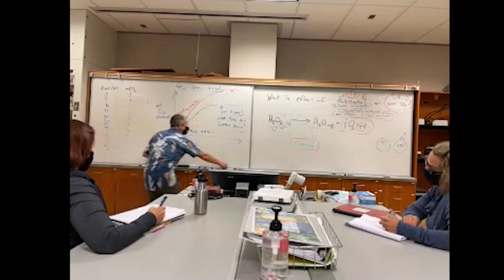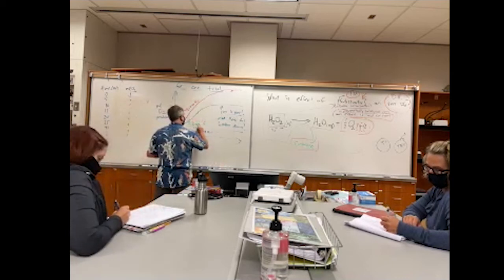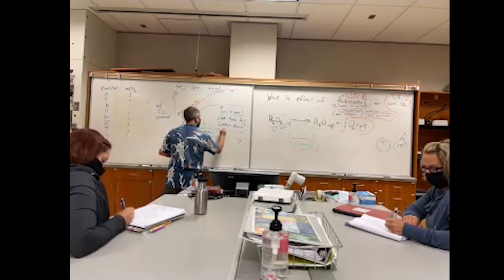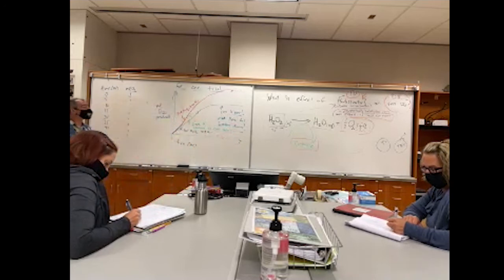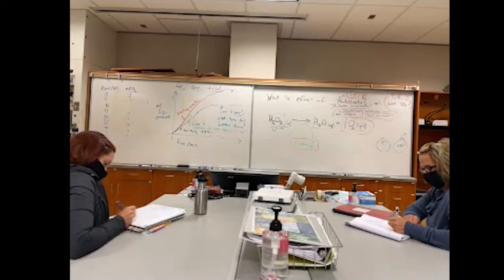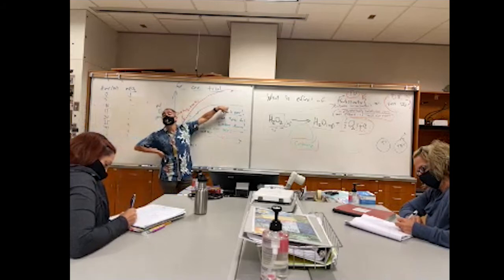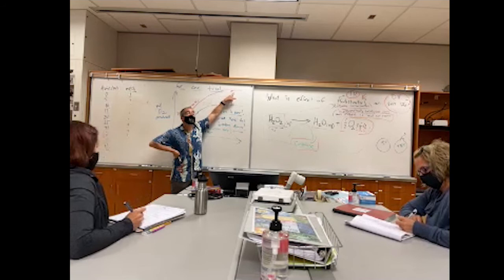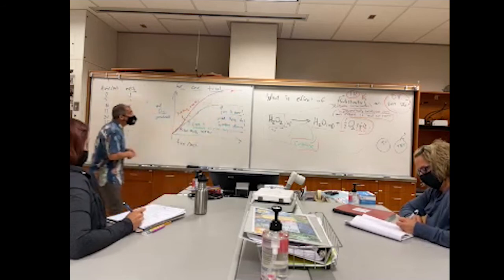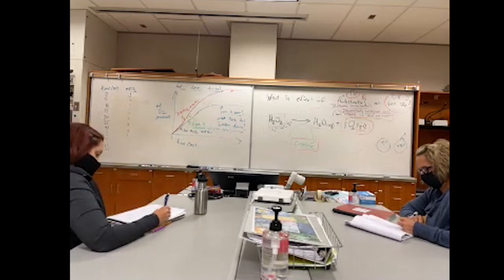So in fact, that's going to be an important point. Slope is going to be a measure of the reaction rate. The greater the slope, the faster the reaction is going. In both cases, eventually the reactions pooped out. This one had more oxygen by the time it pooped out because there was more hydrogen peroxide to break down in the first place. So we made more oxygen. We're going to be doing this 5 or 6 times actually, including the pure water.